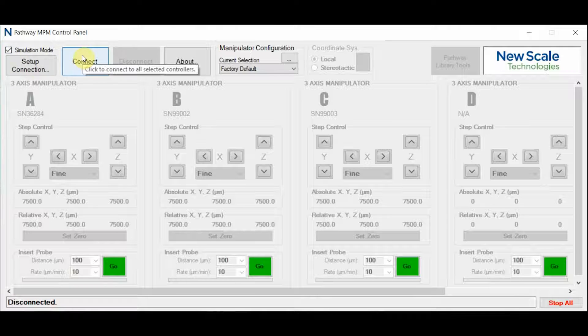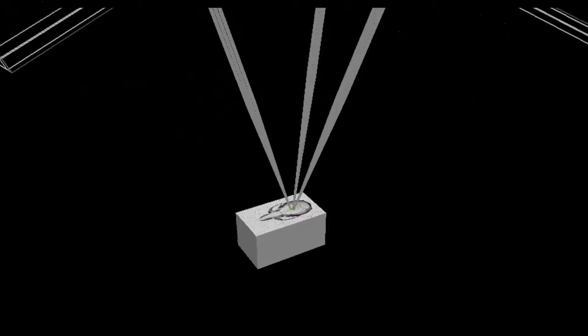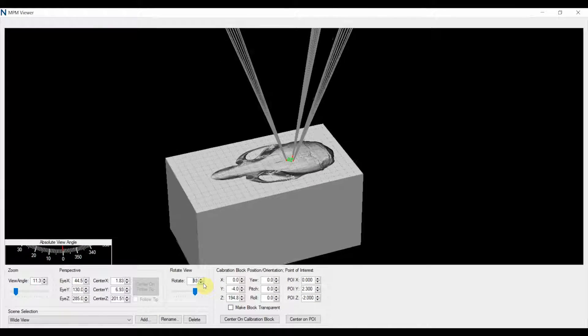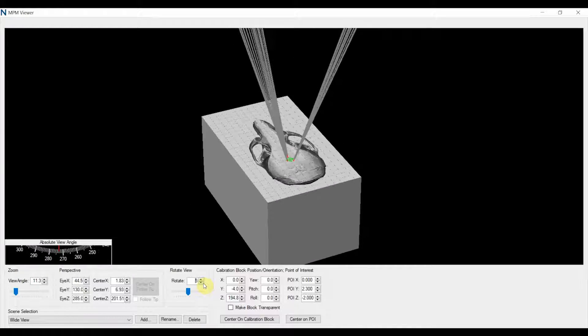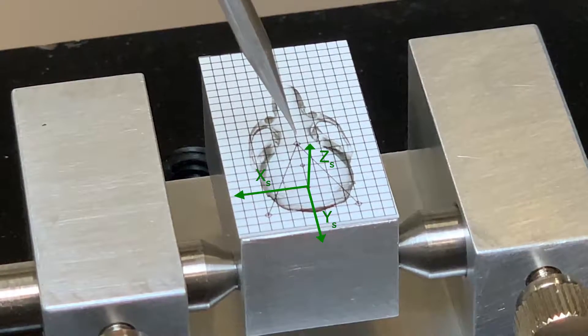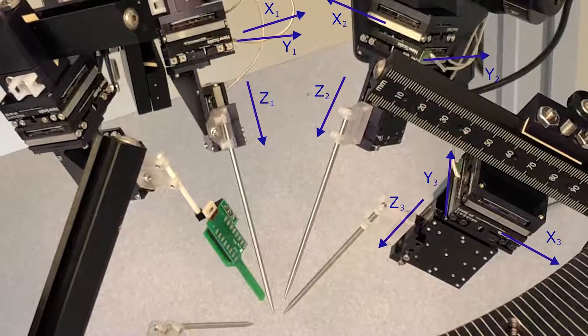The array of new features and capabilities is called the virtual coordinate system. Each probe in your NPM system can be automatically moved along a standard set of stereotactic axes, even when the manipulator arms are aligned to different angles.